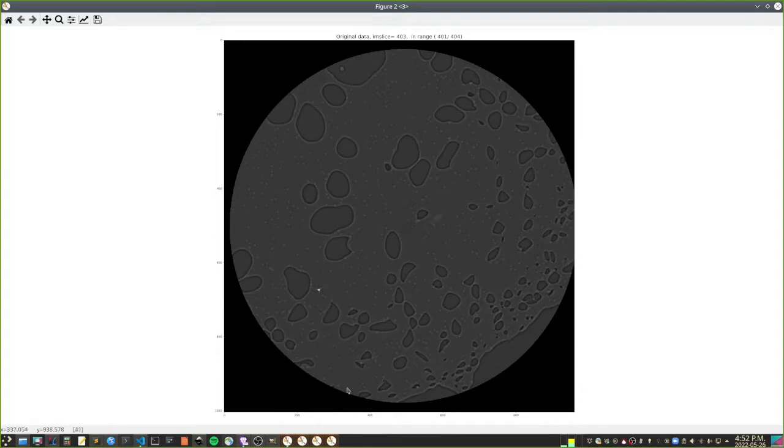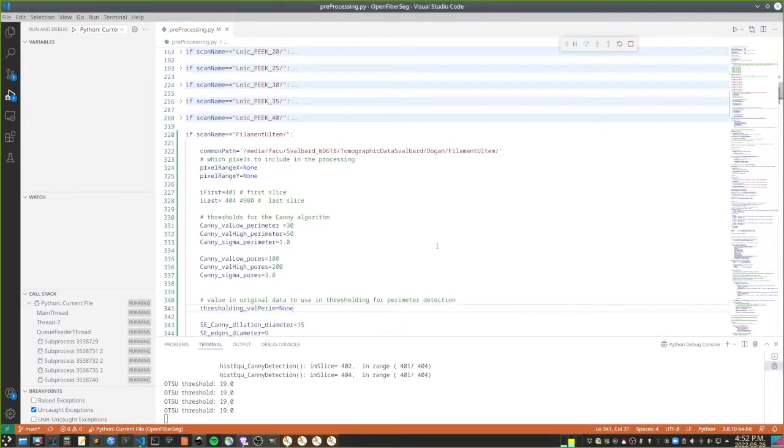And what we want, if you look in the bottom of my screen on the left, there's a number between brackets. I don't know if you see it, it changes, a single number. Like now it's 38, 37, 38. That's the value where I'm pointing my cursor. So you can get an estimate that way. Outside is 0. Now if I'm inside the empty zone, it's 36, 37. And then there's almost always a lighter region at the perimeter. That's 23. Anyway, we'll try numbers a bit at random until we find something that's satisfactory.